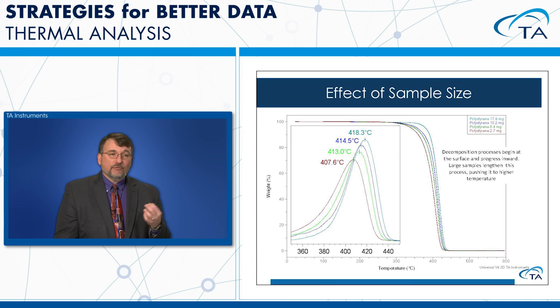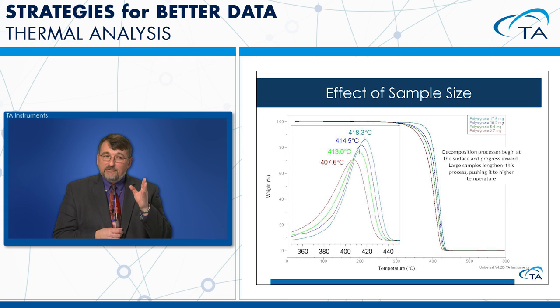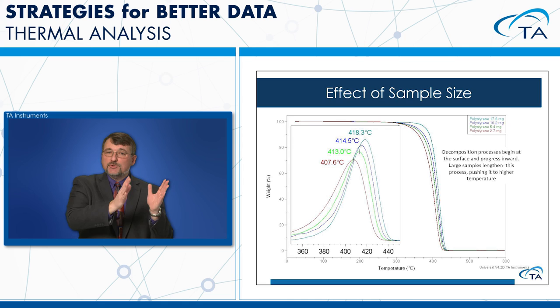An example with polyethylene ranging from 2.7 to 17.6 mg run at 10°C/min shows a shift of about 10°C in TGA curves and derivative peak position as sample mass increases. Going to bigger samples shifts transitions to higher temperatures — something to be aware of when interpreting results.